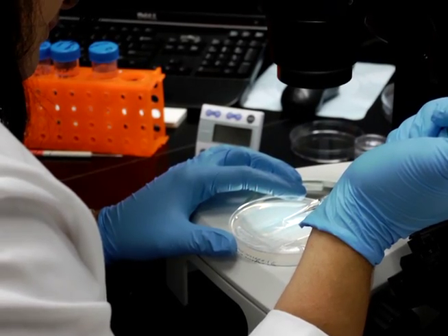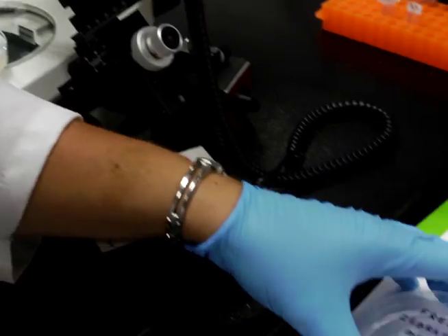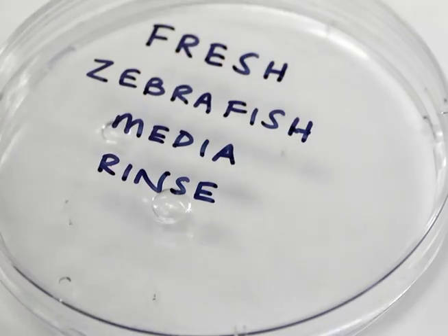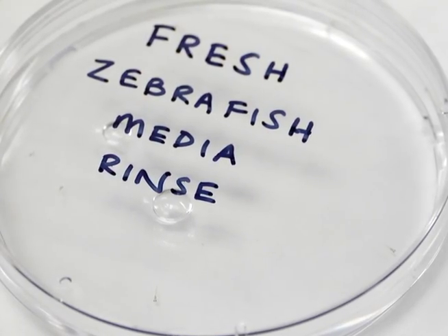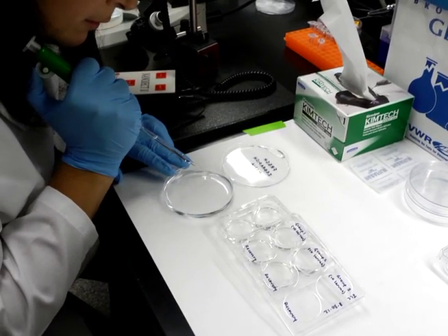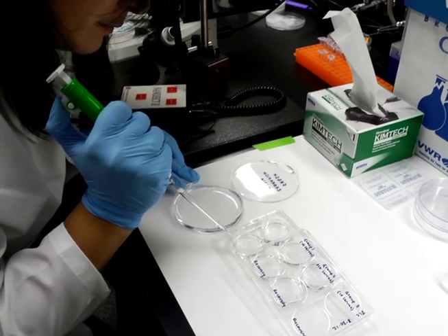After removing the gavage needle, transfer the fish to a dish containing fresh media. Revive the larvae from anaesthesia and remove the methylcellulose by rinsing them in fresh media several times. Transfer the larvae to a petri dish or six-well plate until needed for subsequent analysis.